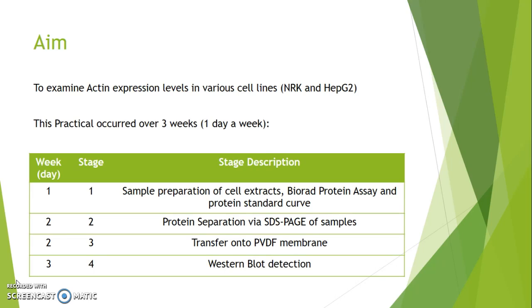This practical occurred over 3 weeks and it was 1 day a week. In the first week, the first stage of the overall process occurred. This was sample preparation of cell extracts, Bio-Rad protein assay, and protein standard curve generation.